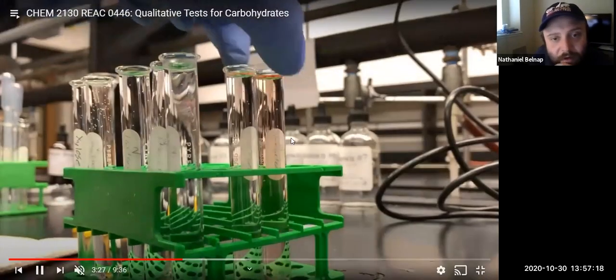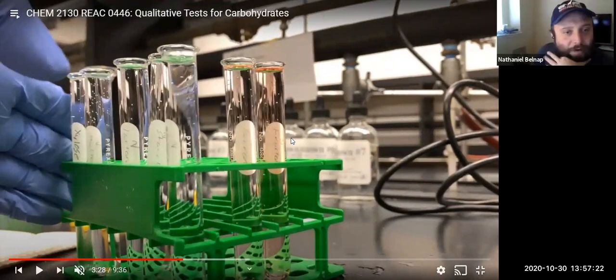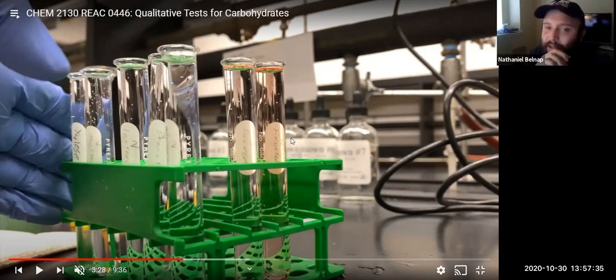What did it say? Sucrose there? Those are the peach ones. Yeah, I mean, it looks like fructose is the most peach one, though. Does that not seem like the case to you guys? Yeah. So sucrose has got a very light pink to it also. Yeah, it has a light pink to it too. So I would say that's also positive for that, and it turned to that peach color that Lauren had mentioned.